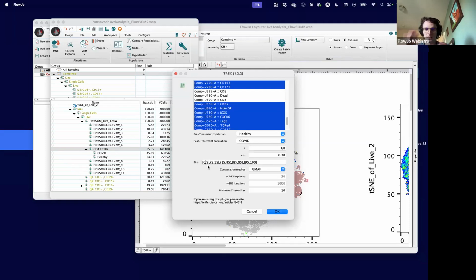So it's just going to group basically the clusters, based on how much of only one type of the two conditions are represented in them. We can change the bounds of these bins just by deleting the number and replacing it with 7. It'll highlight red though because it's mad at me until I replace this bound as well. So the bounds need to match on either side. So if I change this to 7, I have to change this to 7.